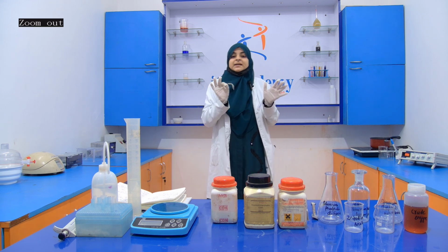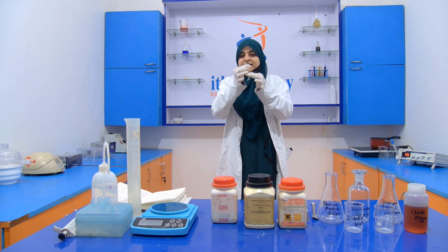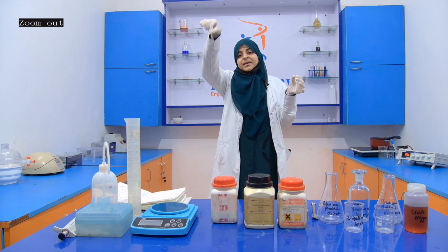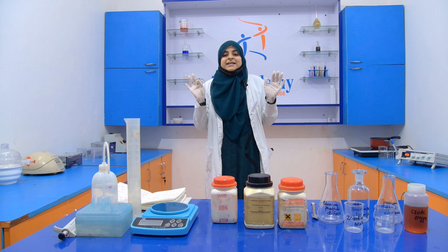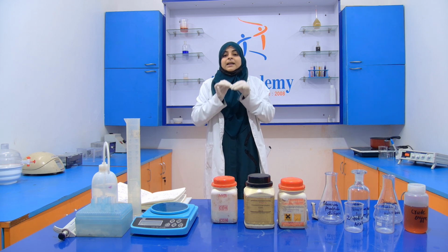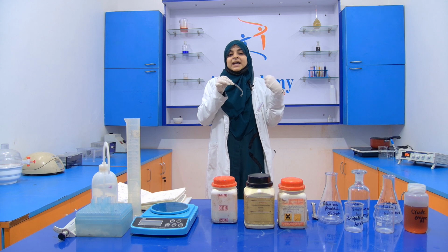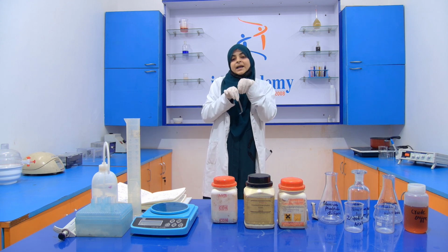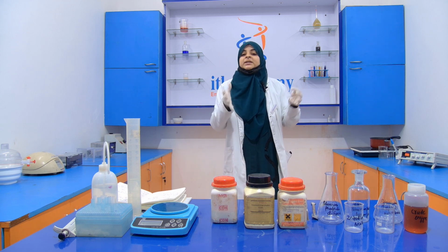So the basic idea is this only. We pour the crude enzyme inside the dialysis membrane, and then we put this dialysis membrane inside the buffer and keep it at 4 degrees Celsius overnight. Due to the small pore size, the movement of the molecules takes place from the higher concentration towards the lower concentration, and that's how the separation occurs.